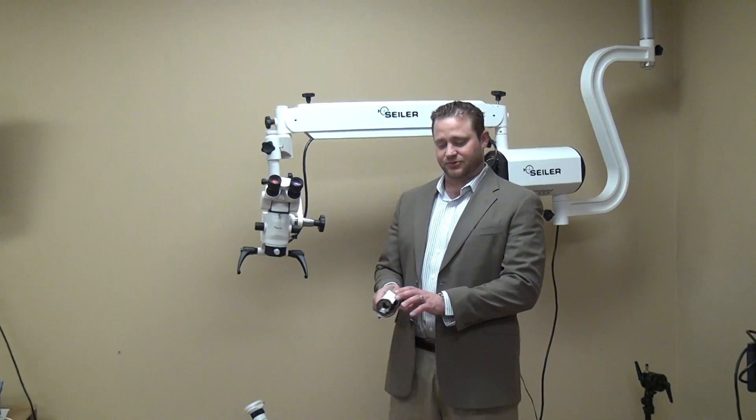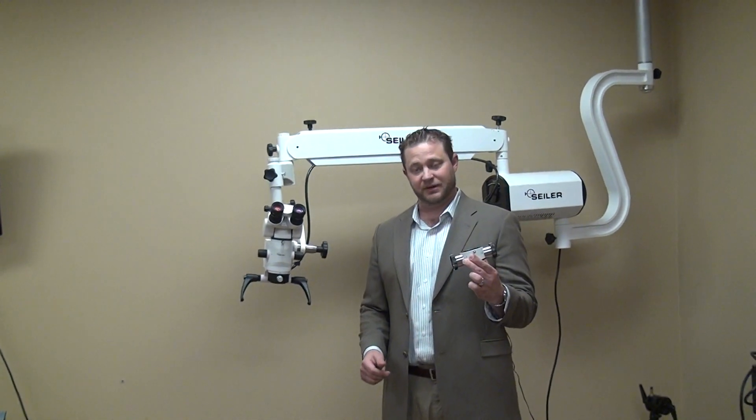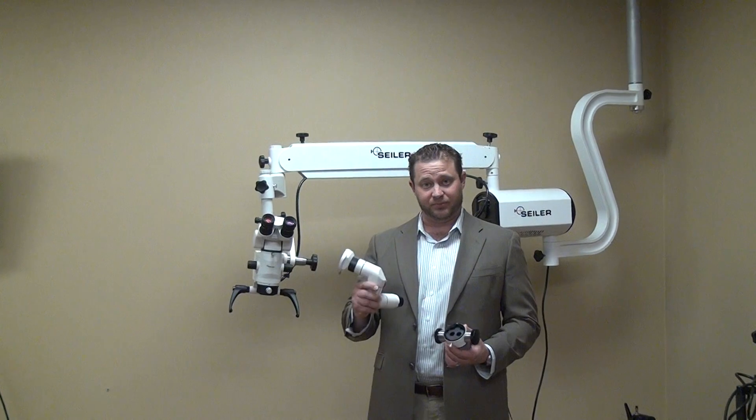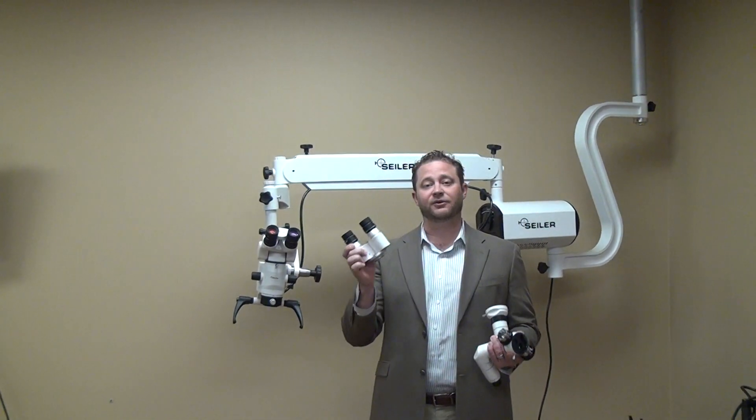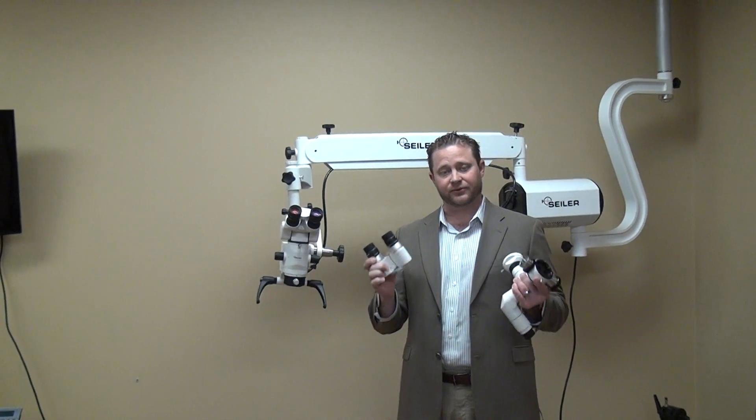The three accessories you're going to need are a beam splitter, your tube coupler, and the actual binocular head that will fit onto the tube coupler. So there are three individual parts.